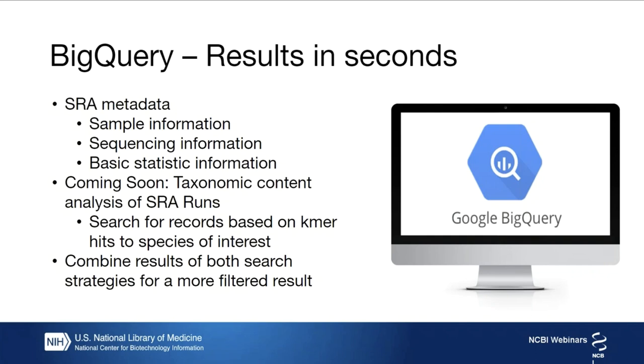So this allowed the user to select high quality data sets from a particular sequencing platform they were interested in, or if they wanted the run to be of a certain size.